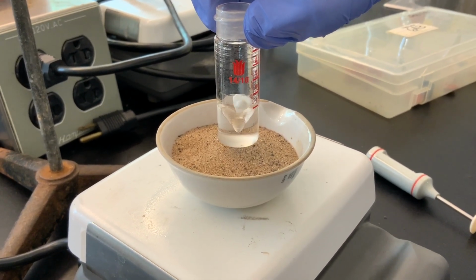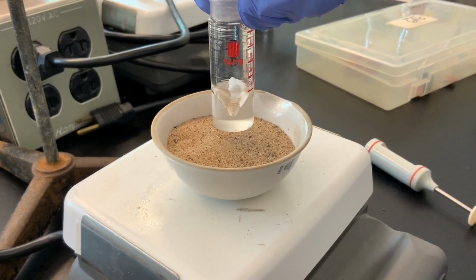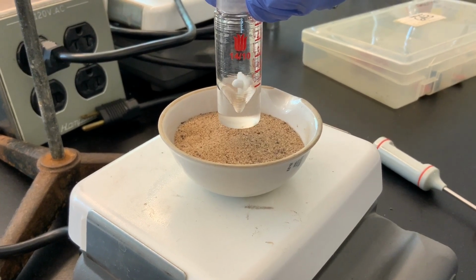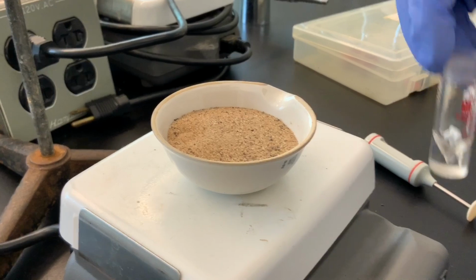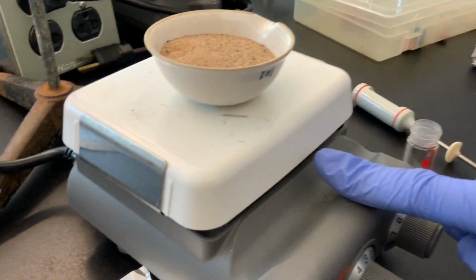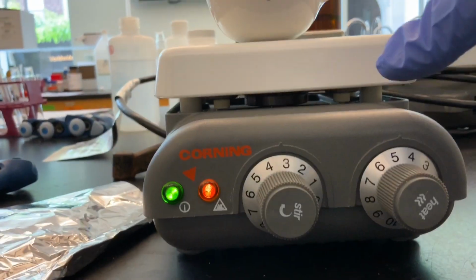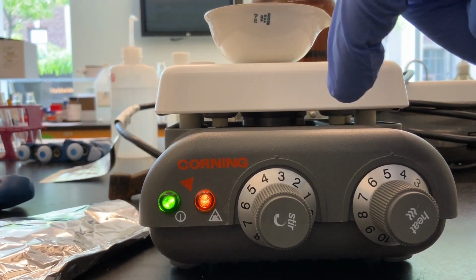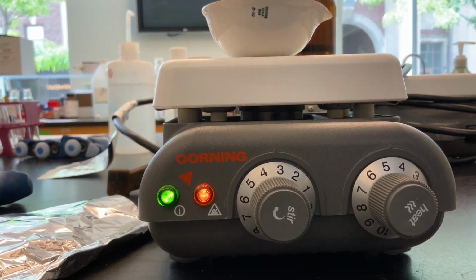We'll talk a little later about how Teflon expands upon heating, so it might be an issue later if the Teflon magnetic spin vane chokes or stops stirring. If you look at the stir hot plate and peer through the edge down here, you can actually see the rotor spinning around. It's spinning a magnet, which is why the spin vane itself is also stirring.